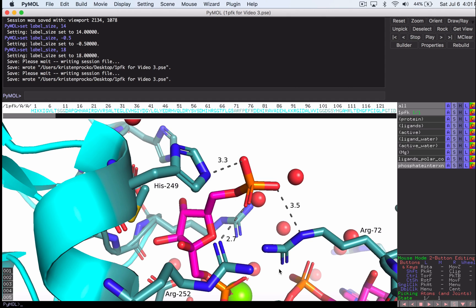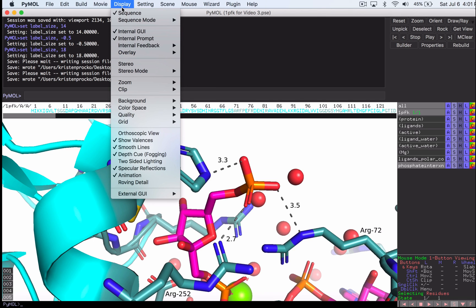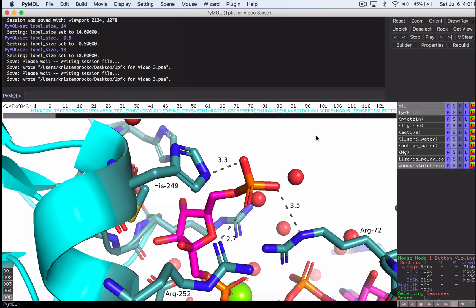I am again using a trackpad, so I'm going to scroll with two fingers on my trackpad. Oh, I actually, I think I need to leave edit mode, so one button viewing mode again. Okay. And now we can see if we can apply some clip. Actually, I think we were just about at the clipping that we could. So that'll apply clipping, also using the scroll wheel on a three button mouse will do clipping. Or you can apply clipping manually right here to different angstrom slabs. So I think this image looks pretty nice. We have our labels in good spots at good sizes, and yeah, I hope that helps you to create some really nice looking, nicely labeled images.